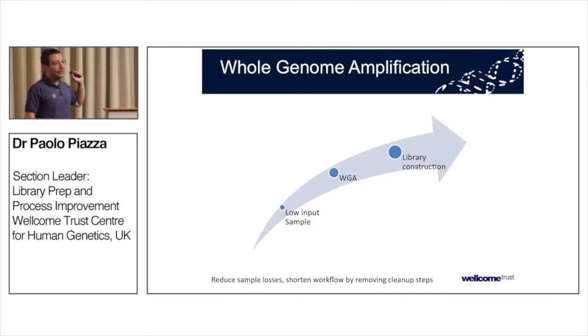So, having said all that, the first example I'm going to show goes against everything I've just said. Here is an exercise that we did with a PhD student who was visiting the lab. His interest is in pre-implantation diagnostics. So we wanted to see whether we can do whole genome amplification and sequencing starting from a small number of cells, ideally 1, but 3 to 5 is fine. It's also just a few samples, so it's not high throughput. Phi29 kits that do whole genome amplification are fairly cheap, and because you only do one sample or so, reducing cost is not really a major target.